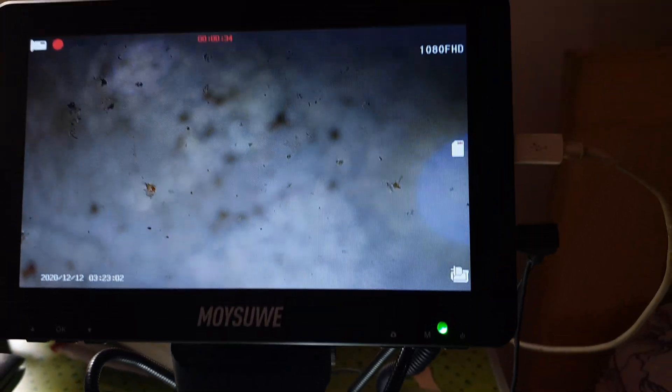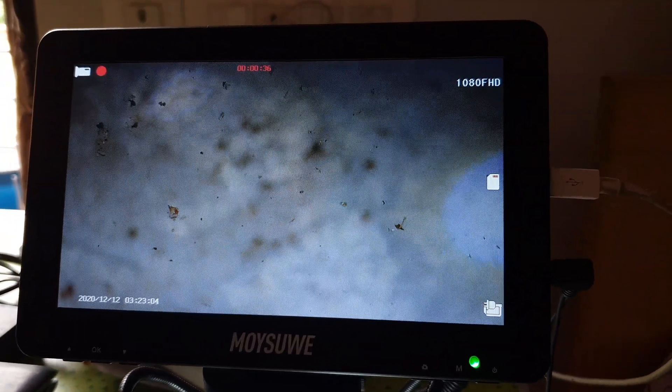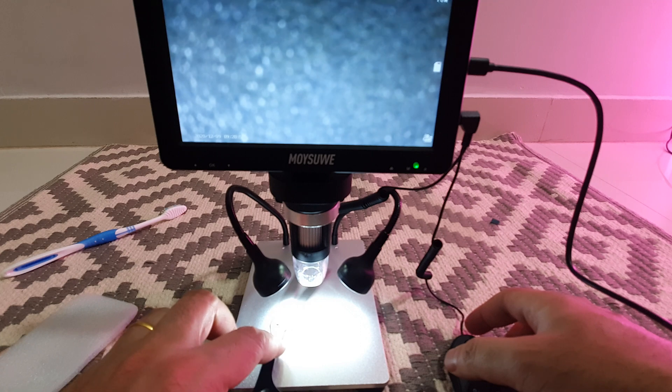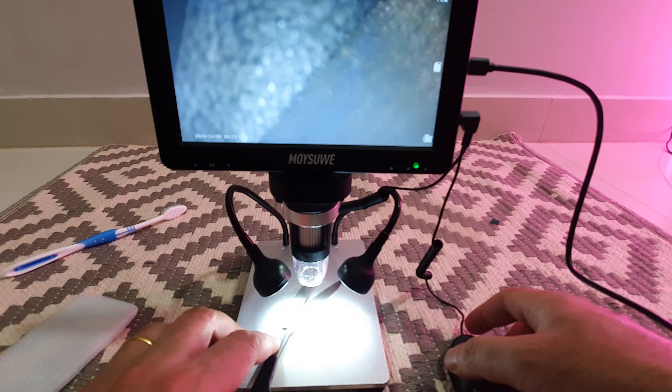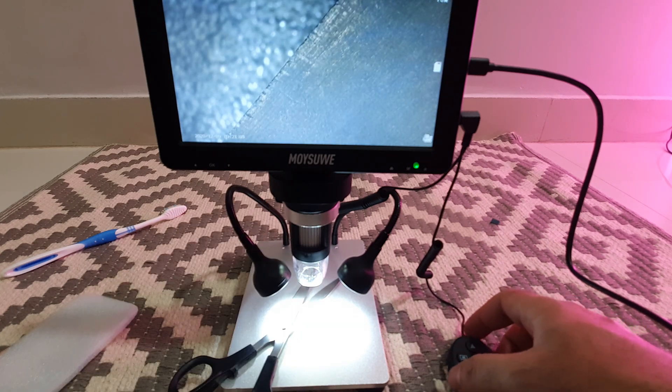I put some stagnant water in a small cup and this is what I could see. A lot of rubbish there and something's moving around. When I actually change the focus I can look at the base of this whole thing. I put a scissor there just to see how the edges look and guess what, they're not fine.